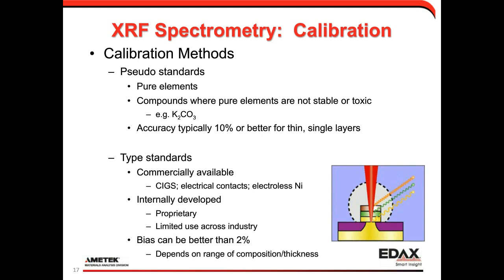My comment here on that would be that if you're making something out in the factory and you want to create standards to measure those things to the best accuracy possible, then I would use the same methods that you're doing out on the factory floor to make those samples. You don't want to make something in a small batch that gives you a slightly different material, a slightly different density than what's going out on the factory floor, because your results will be different.